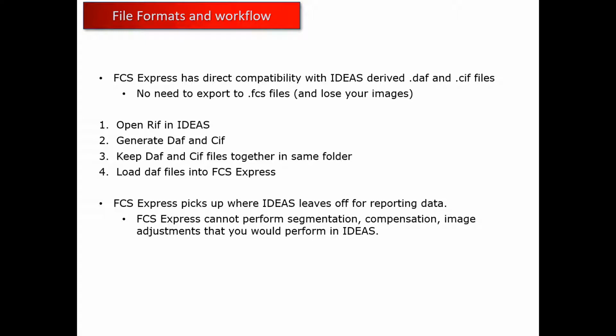So, if you need to create plots for publication, if you need to get statistics, if you need to do IC/EC50s, FCS Express is a great choice for doing this. However, FCS Express will not perform segmentation, it will not perform the image compensation that Ideas does, it won't perform any sort of adjustments to your images.